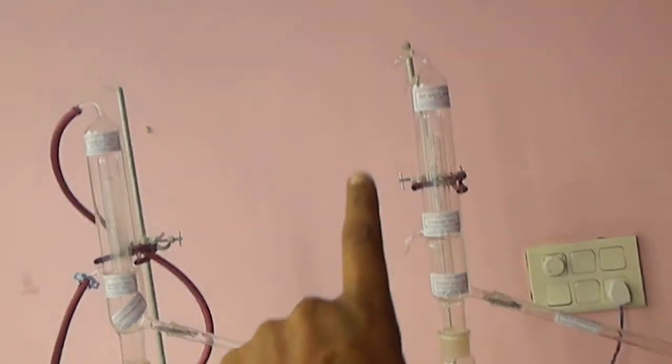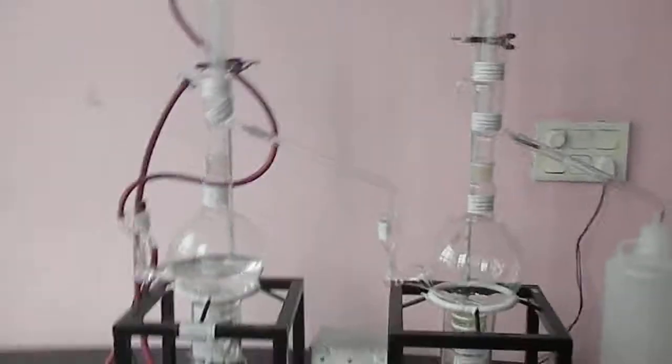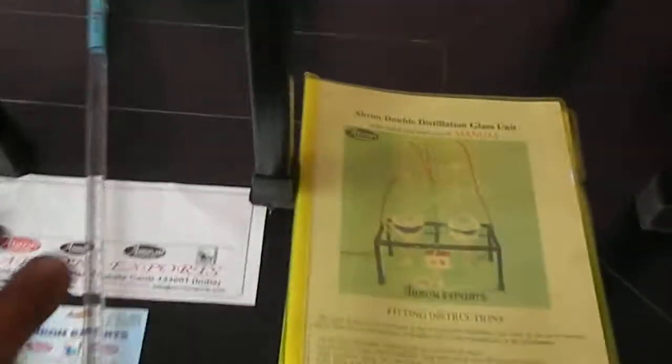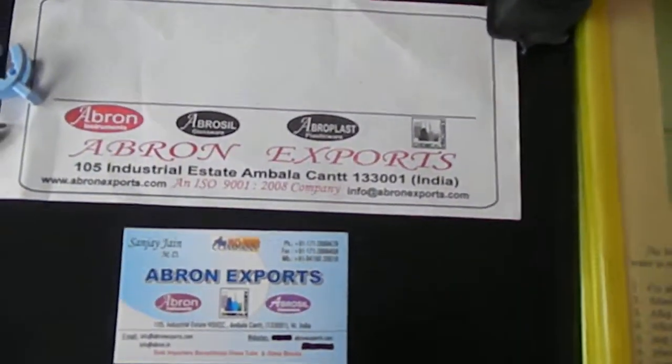But for the second section, it will go to the waste outside. So this distillation is very easy to fill and use. Please visit our website. We have provided an elaborative manual.